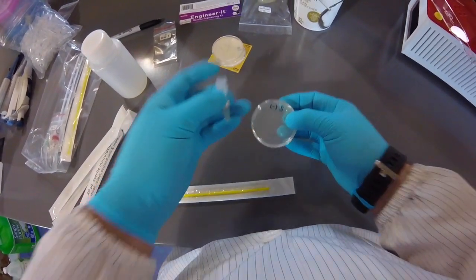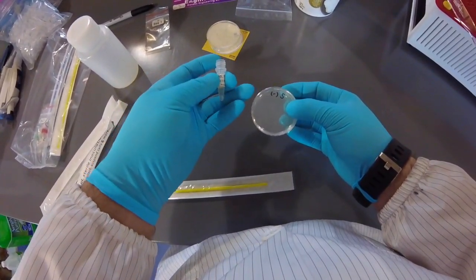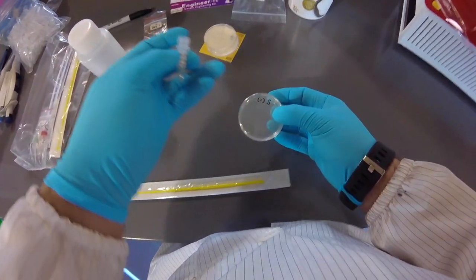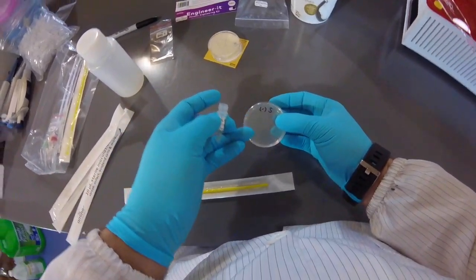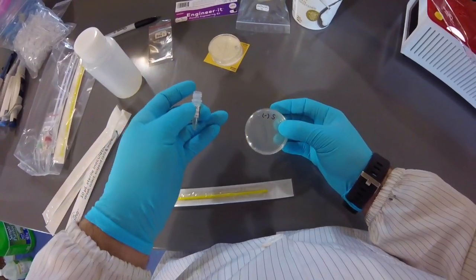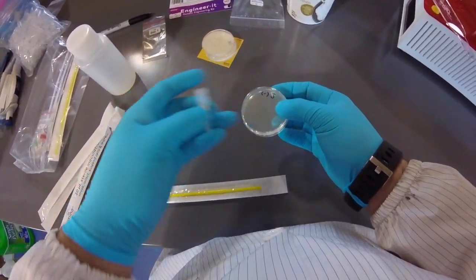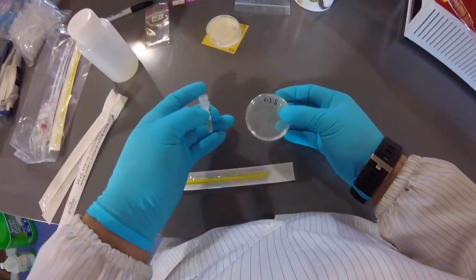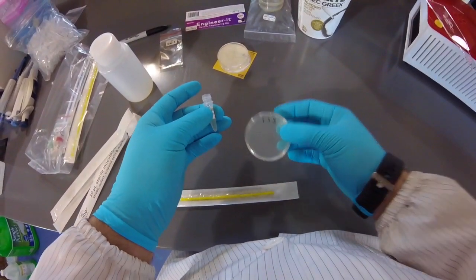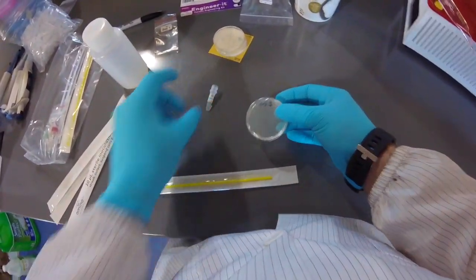So in other words, if the experiment works well, there should be no growth on this plate because these bacteria won't be able to survive, all right? If, let's say, you forget to add the antibiotics, or let's say the antibiotics are bad, or something just went wrong where the antibiotics aren't in here, or they're in here in a low level, you could actually see cells growing on here, and that would tell you that something is wrong with the selection in this plate because blank cells should not grow if there's the right amount of antibiotics, okay? So that's why it's a negative control, because we expect things not to grow.